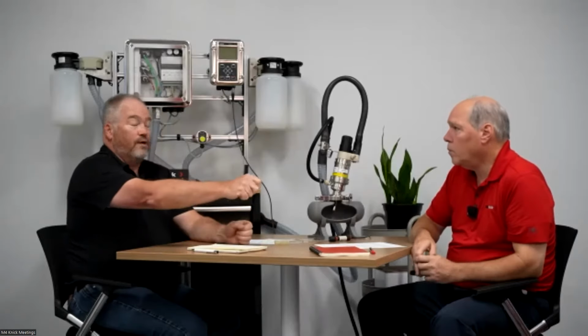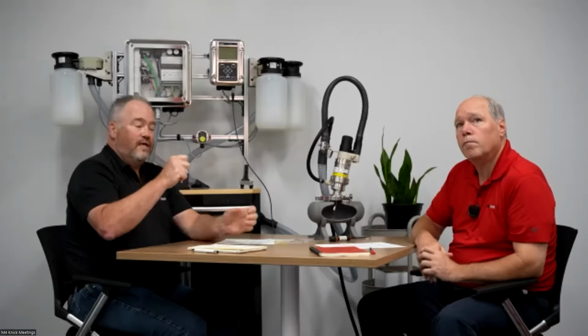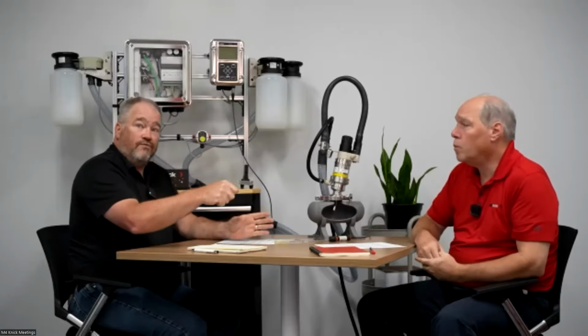And in that industrial environment, if you have a static loop and then you're going to physically pull that electrode out, you're going to do a manual calibration, of course, putting in your calibration solution. Let's say it's a buffer 4 or buffer 7 and a buffer 4. You may be rushed a little bit for one reason or another, right? So when you go to put that electrode back in the process, is that calibration as accurate as you could have gotten it? Maybe not. When you automate it, those calibrations are the same every time. They're very precise. So that leads to, back, Joe, to your question about product quality.